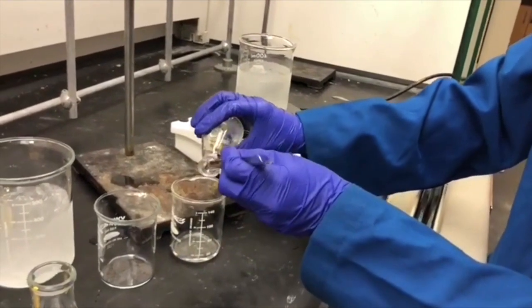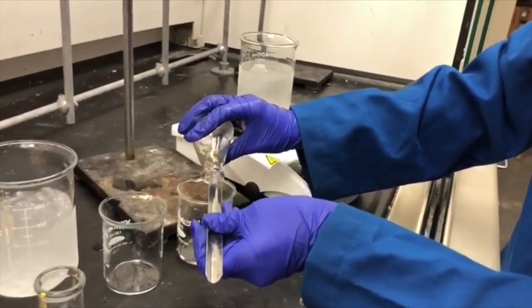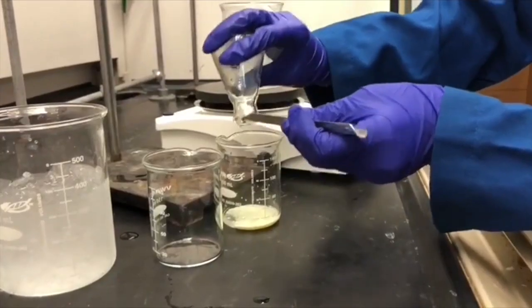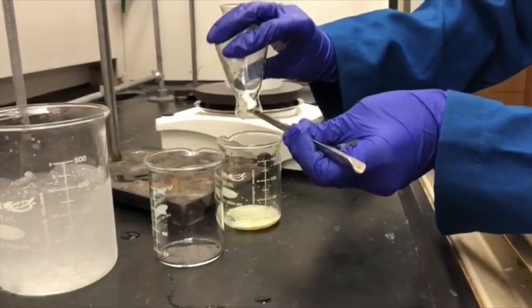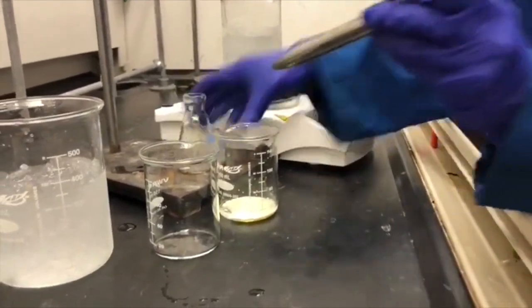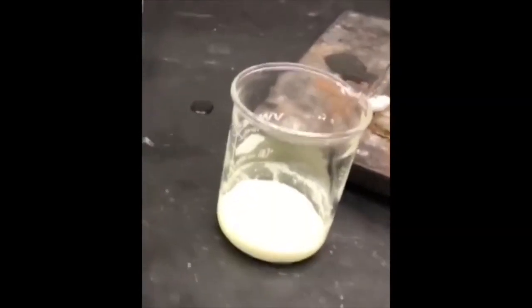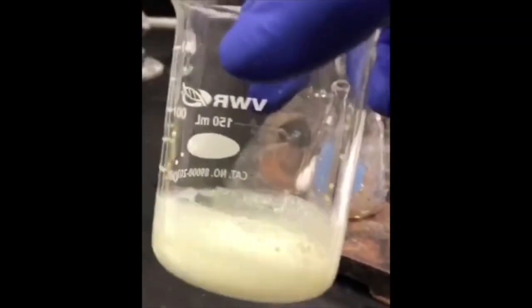I'm just using that scoopula to prevent the stir bar from going into the beaker. And you can see precipitation forming inside the beaker, and that is our product. And we're going to let it sit for 5 to 10 minutes to complete the precipitation.